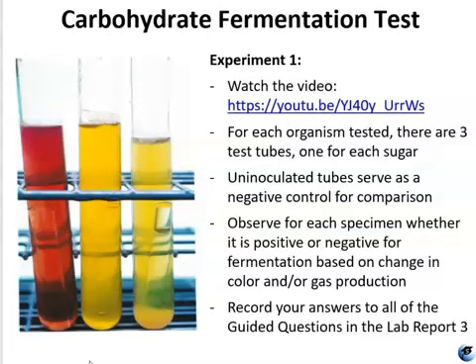You're going to observe and record for each of these tests whether it's positive or negative for fermentation, based on the color and whether or not you have gas production. Make sure to answer all the guided questions in your report template for those.